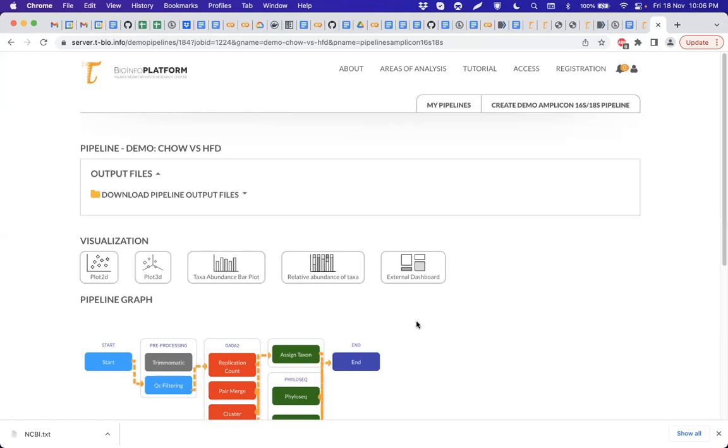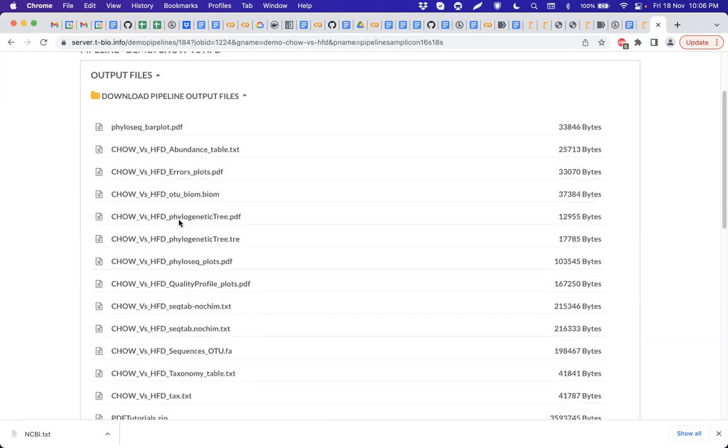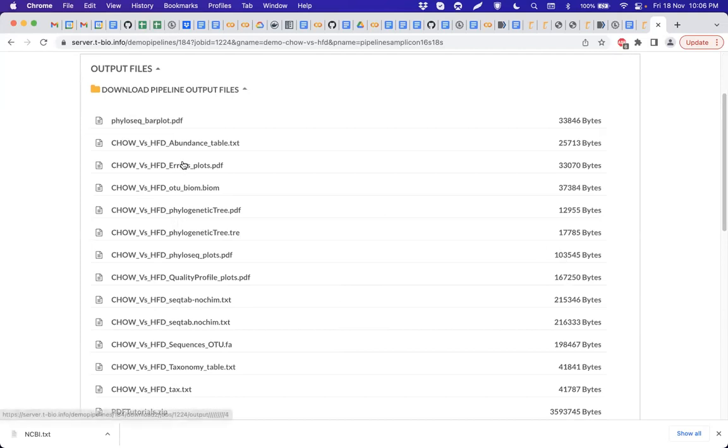Let's find, for example, yeah. You can see my screen, right? I will show you when we are dealing with QIIME in a short while. In this output file, you can see the error plots. This is where you will get all the error plots that I showed you. So even before you go through your analysis, take a quick peek into these error plots.